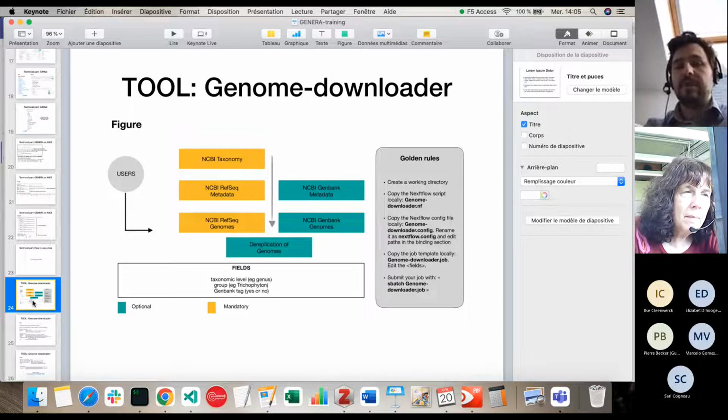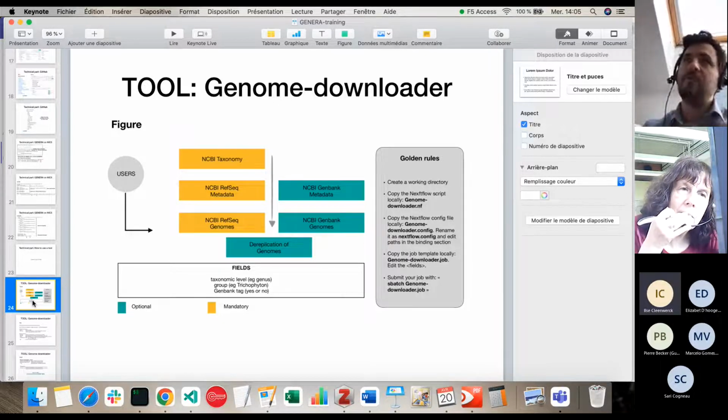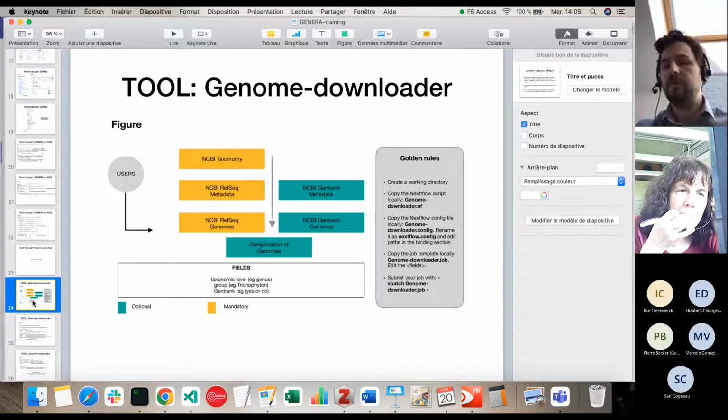But currently, yes, it's prefixed, so it's the default threshold of dRep, because from my usage, all the workflows of Genera are designed for phylogeny to help the taxonomy, and in that way, the dRep threshold was always a good thing to do. But we can set up different MASH thresholds, and one thing that you can do is run different phylogenies with different MASH thresholds.